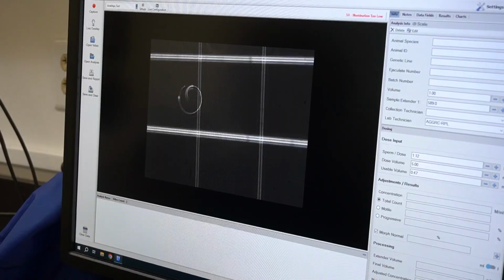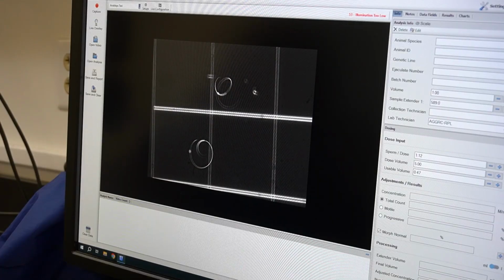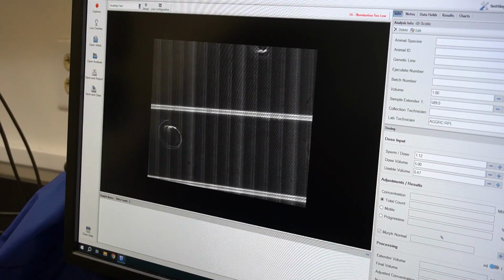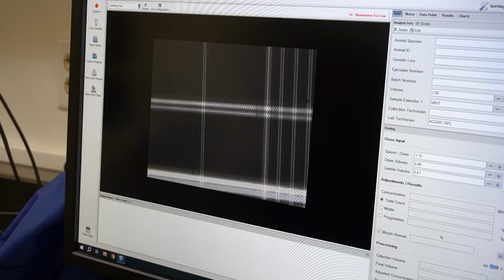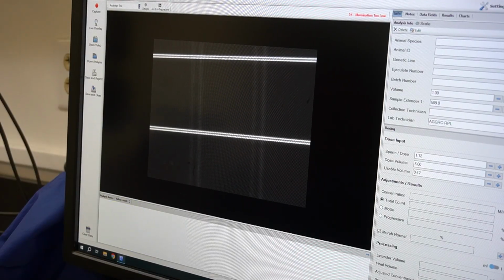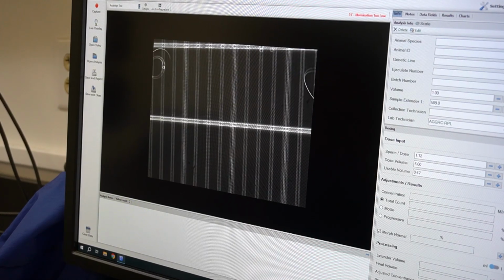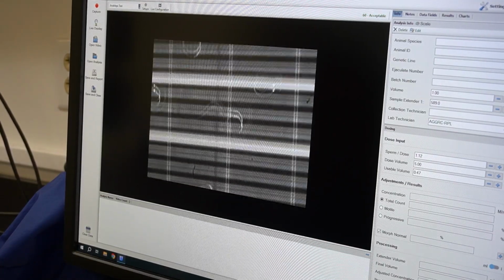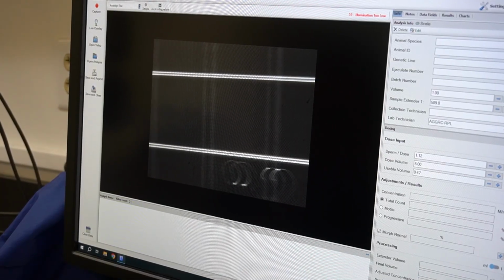Okay, so it's kind of hard to see on the computer. You'll see it better in the microscope, but what we're gonna look for is this pretty decently wide grid. I'd say it's like the 12 by 12. The number of boxes doesn't really count, but we have this grid here, this grid, and then our center grid. So in the 4 corners and then in the center. And then what we'll do here is we just count the number of cells we see per group, so I'll do that now actually.